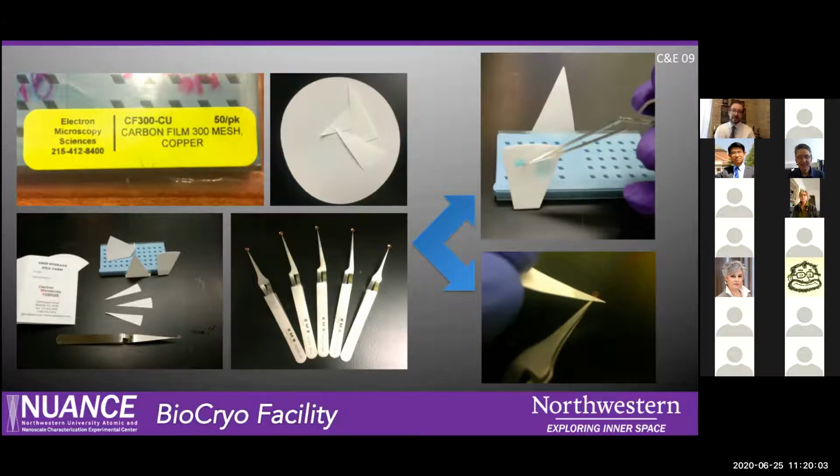So yeah, we cut these out from filter paper, and I do have a whole box of little tweezers, so it's my negative stain kit. You might want to make something like that for yourself if you're going to do a lot of negative staining.